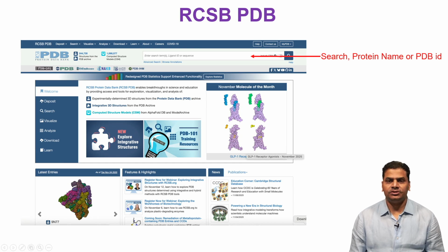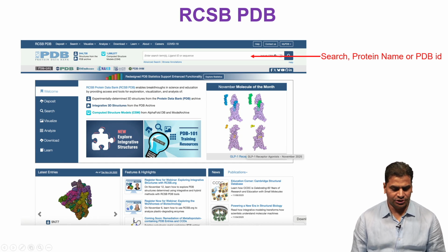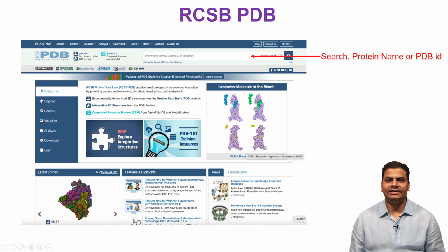So, let me start by introducing this website, which is the website of the Protein Data Bank. You know that the Protein Data Bank is very often used to download the structure of a protein. Basically, it provides the coordinate files, and it hosts structures of proteins which have been experimentally obtained, mostly through X-ray crystallography, cryo-EM or NMR.